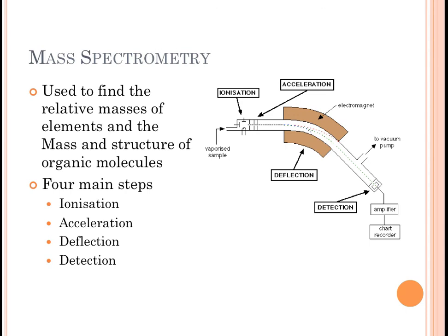Unit 4 Chemistry, Chapter 12, Part 5, Mass Spectrometry. And it is spectrometry, not spectroscopy now, because we're no longer using part of the electromagnetic spectrum, but we're still making a spectrum. Okay? This is a useful technique which you will have looked at before when you looked at the relative abundance of different isotopes when you were first learning about mole theory.